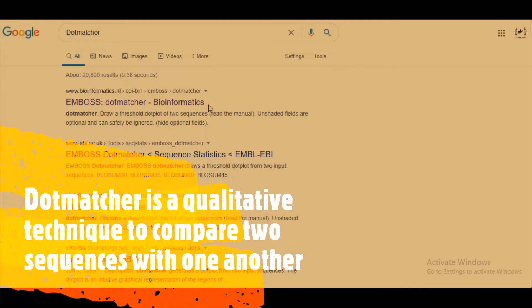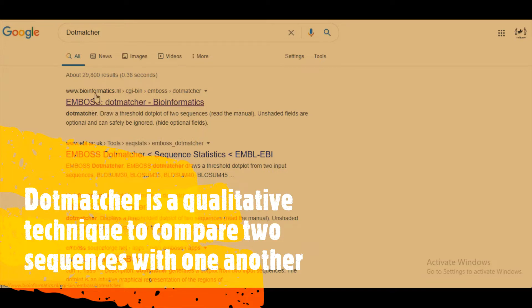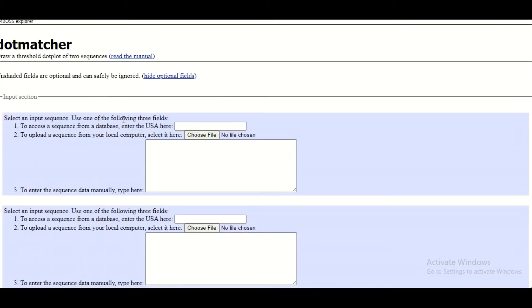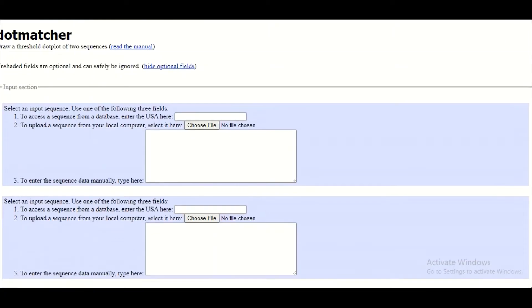There are many different dot matchers available online, but for this tutorial we are going to use the EMBOSS dot matcher. To get access to this EMBOSS dot matcher, we are going to simply click on this URL and when we click on it we will be directly landed to the page dedicated for this dot matcher.